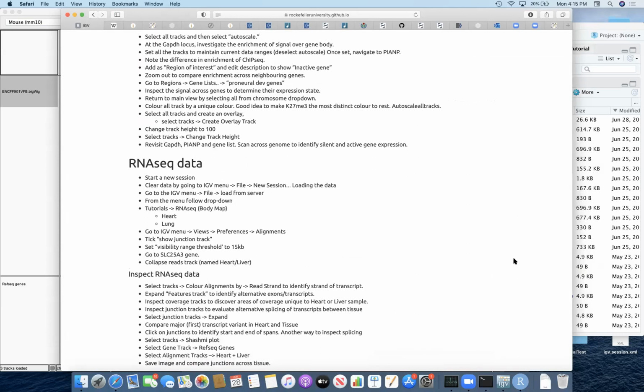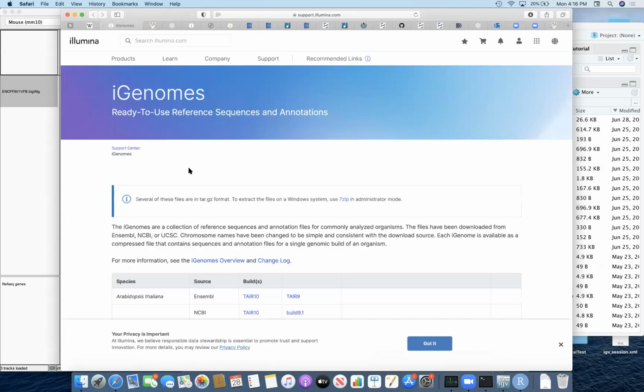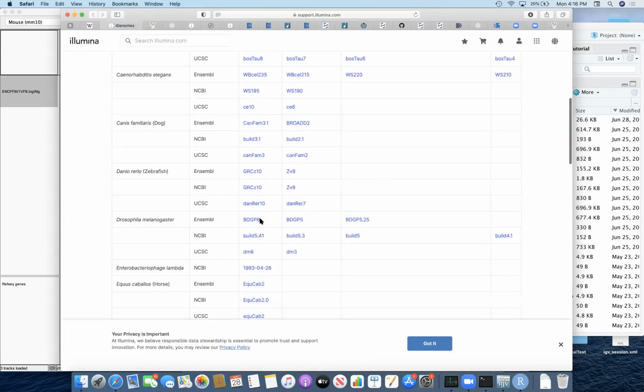I think we had a question from someone. Someone wanted to talk a little offline, maybe. I think it was you, Carolina. Oh, it was to download the reference genome. Yeah, when I click into it, a white screen appears and then it pops off. So there's nothing that downloads, at least on my computer.